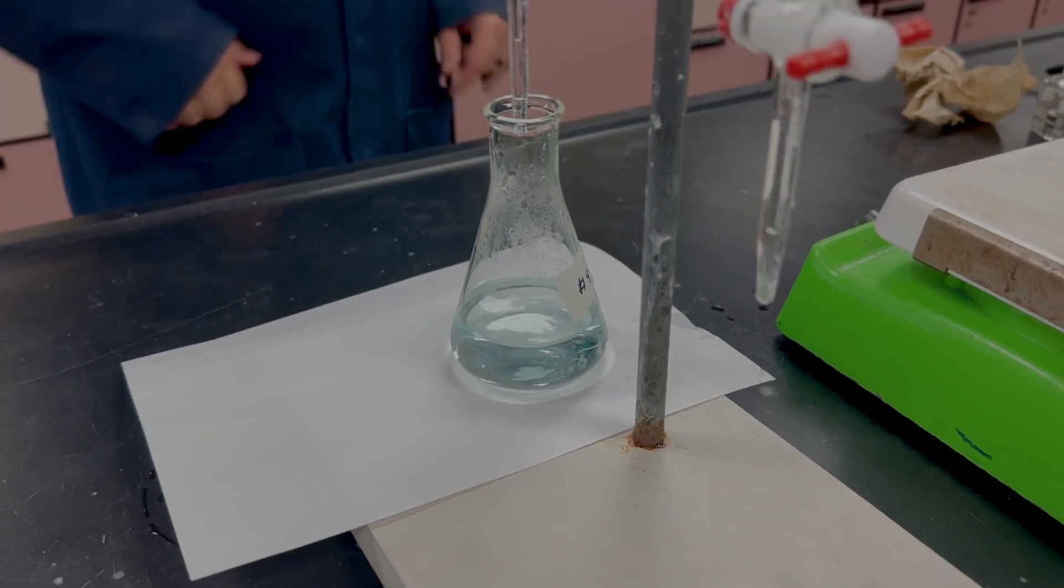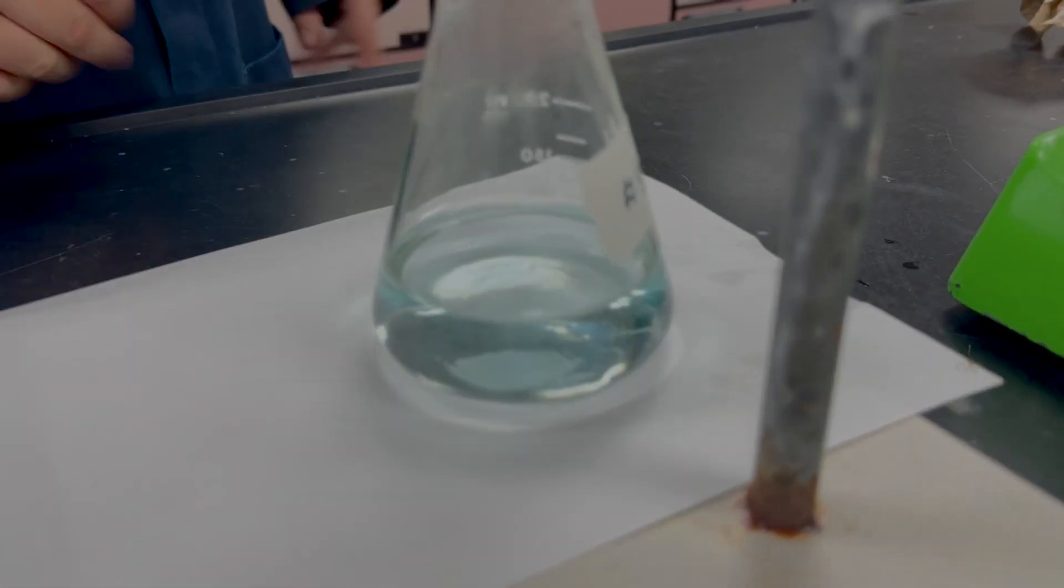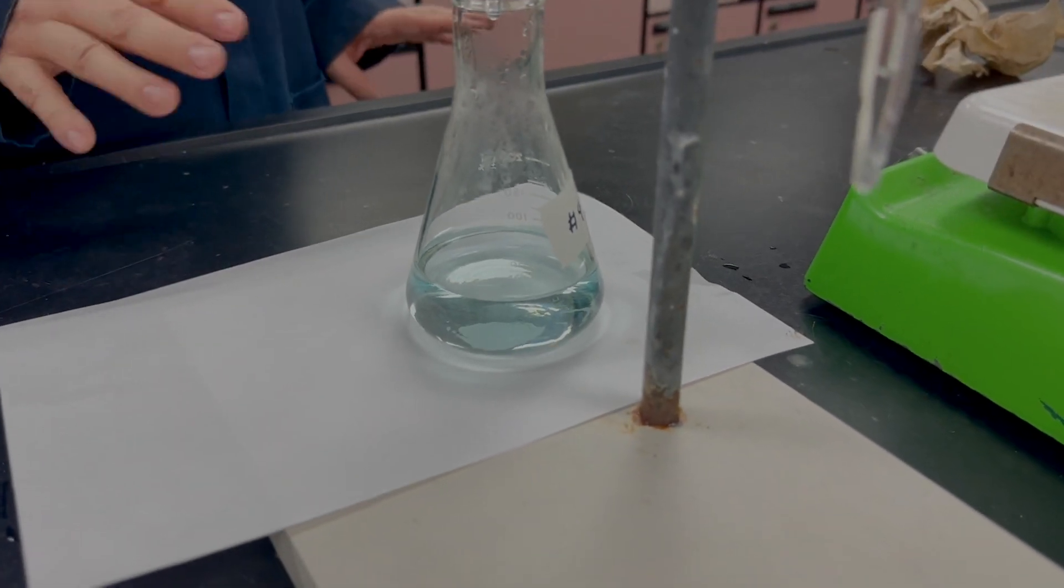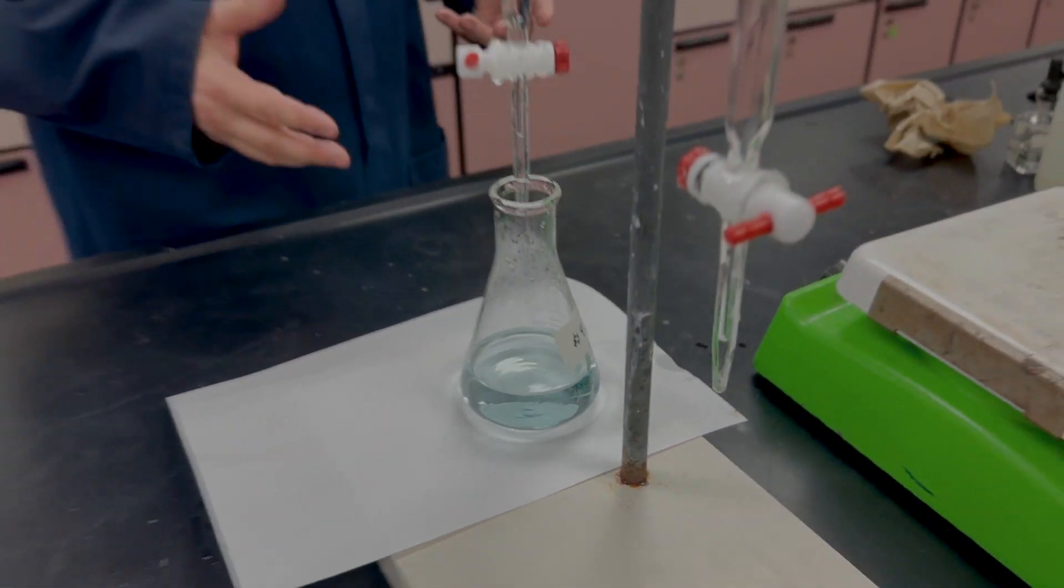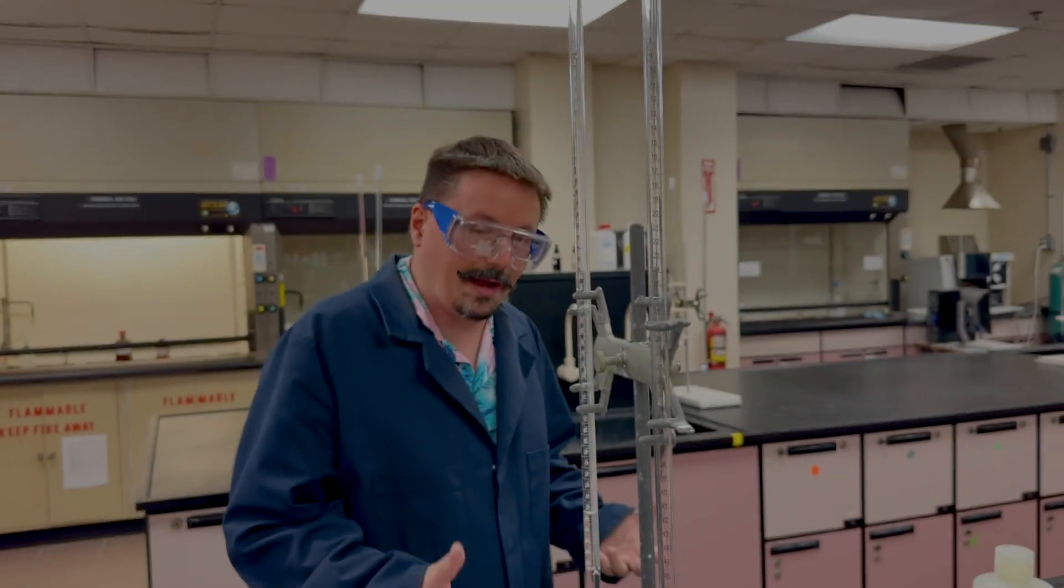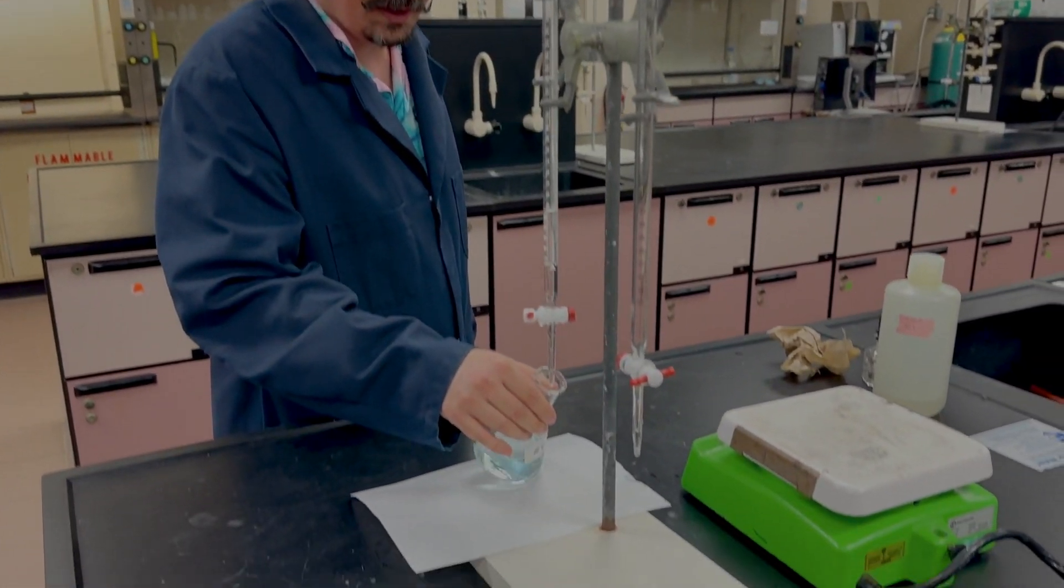You can see it's a faint green aqua color. Because it's relatively light, if you go a little too far you'll go all the way to that yellow. That's okay - you may not have necessarily over-titrated.